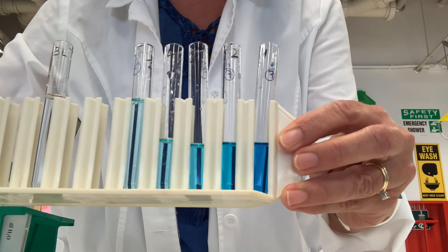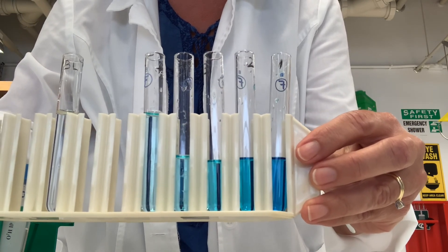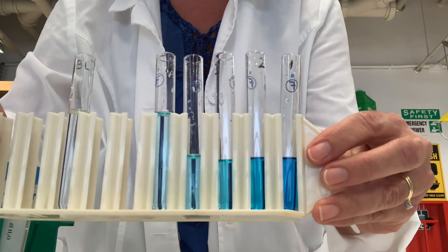Here are our completed serial dilutions. The next step will be to generate some quantitative data by reading the absorbance of these five solutions in a spectrophotometer.